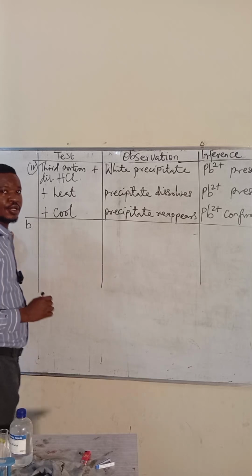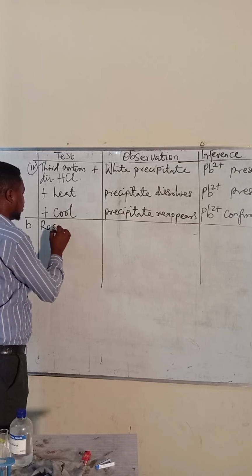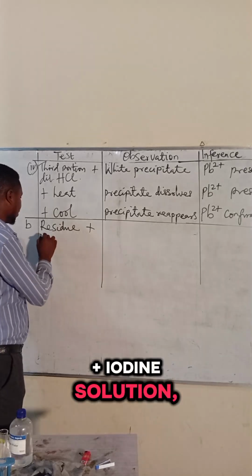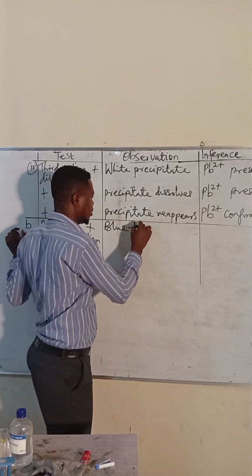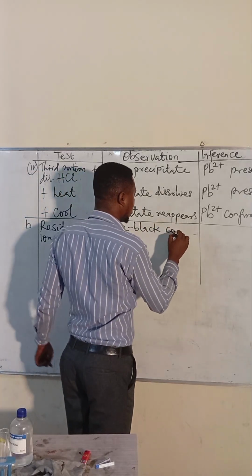Then residue plus iodine solution. Blue-black coloration.